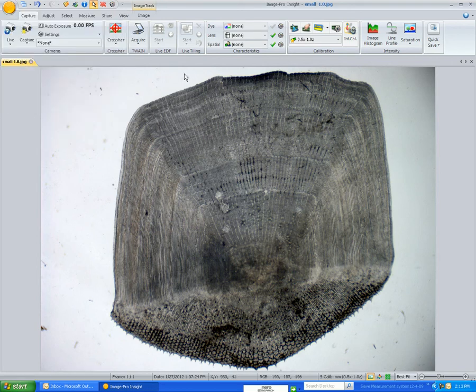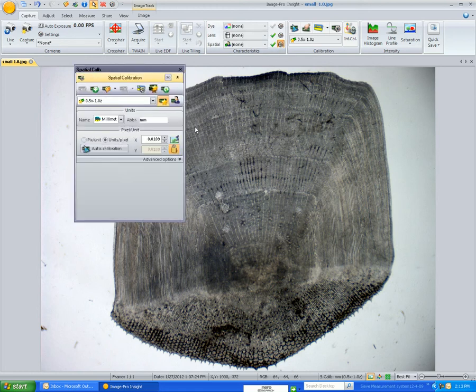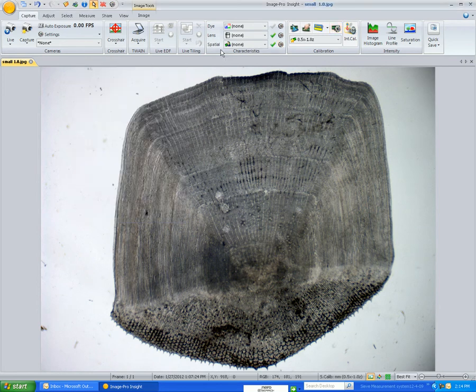If, for instance, you have some calibrations that have been done and you want to delete them, that shouldn't be in the list, I double-click on this icon here. I'll do single-click. From the pull-down menu, looks like I duplicated this one, so I click on that and delete it. I'm going to take off the 60, which deletes it, and so I have these here, which look all fine, and now I have a pull-down menu here.